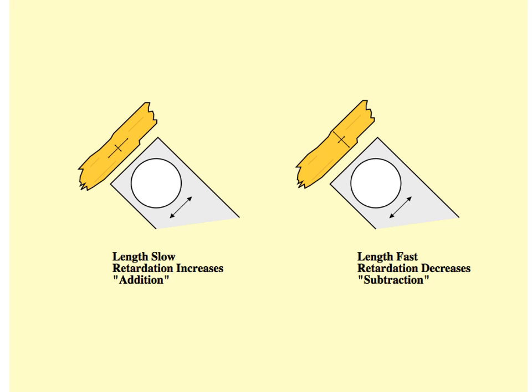So the mineral has been rotated so it is 45 degrees away from extinction, and it's oriented parallel to the edge of the plate, so southwest-northeast. And then the plate has a known slow-fast orientation marked with that little arrow. The long arrow indicates high refractive index, so that's the slow direction. So remember, long arrow, slow light ray.